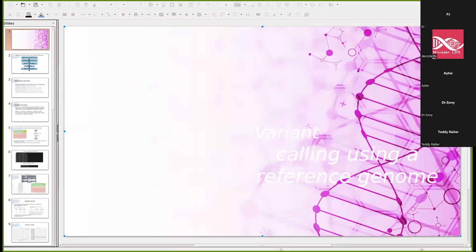First of all, see how the data is obtained from the sequencer after the genotype run. If you have run GBS or RAD-seq, all will give an output of FASTA or FASTQ files. All FASTQ files have a header. This header contains the information of the location on the flow cell.